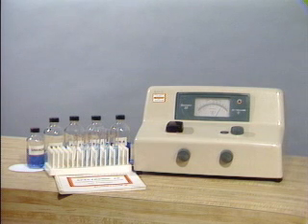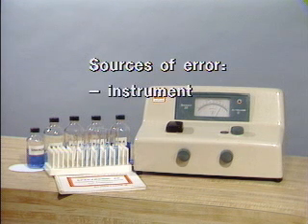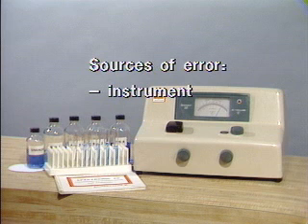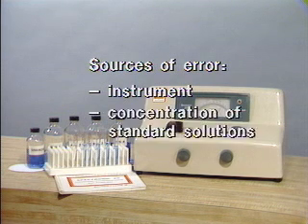The manufacturer can give the reproducibility of the absorbance measurements on the spectrophotometer. This is often of the order of 1 or 2% transmittance. By calculating this error in terms of absorbance, a range of possible absorbances for that measurement can be obtained. In addition, the errors in the solutions of known concentration can be determined from the tolerances of the equipment used to produce these solutions. If these errors are known, or can be determined, the uncertainty in the value of the concentration of the unknown determined from the Beer's law plot can be estimated.